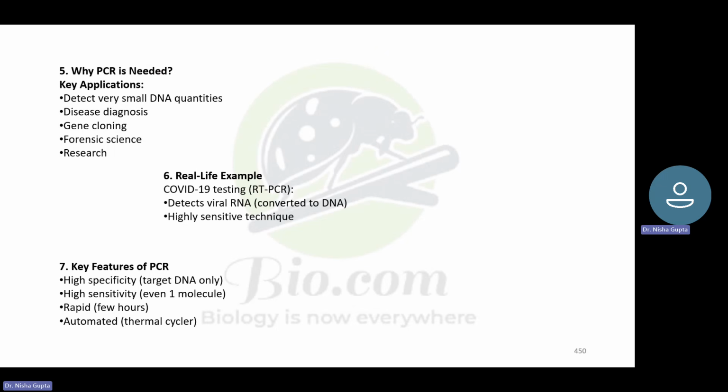So now see why PCR is needed: to detect very small DNA quantities for disease diagnosis, for gene cloning, forensic science and research. Real life example, COVID was detected through RT-PCR. So it is very, very important. And key features of PCR include high specificity, right?